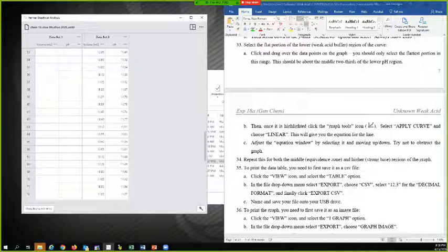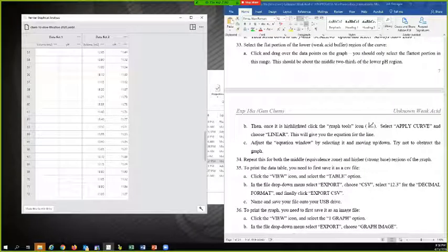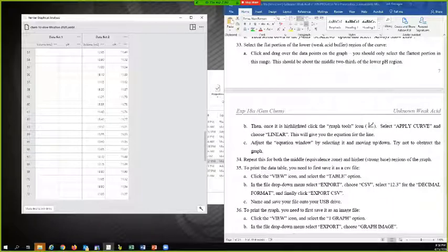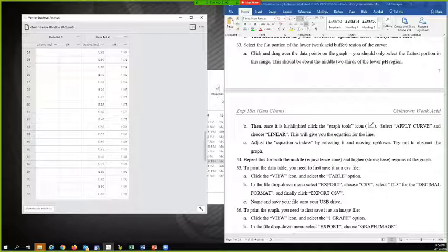So this is going to show all of the actual numbers that were graphed there. In the file drop down menu, select export, choose CSV, select 12.3 for the decimal format and click export.